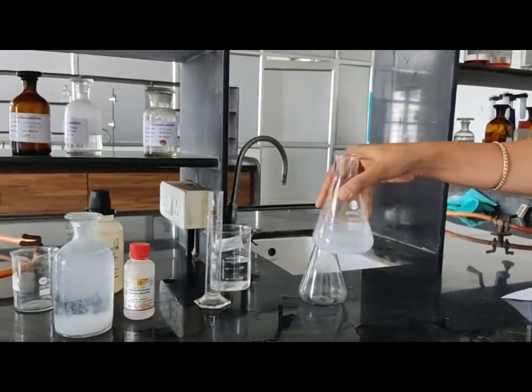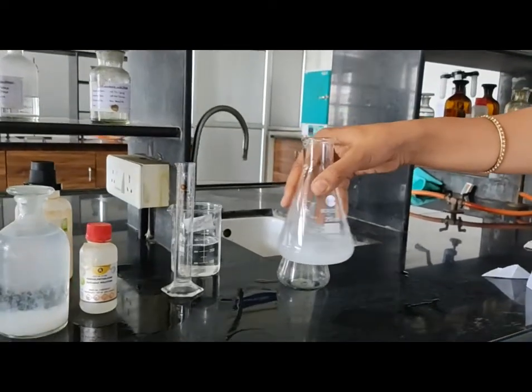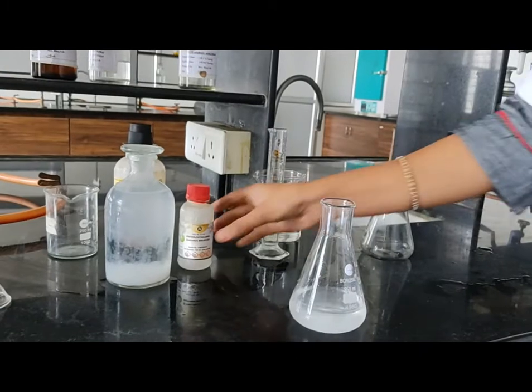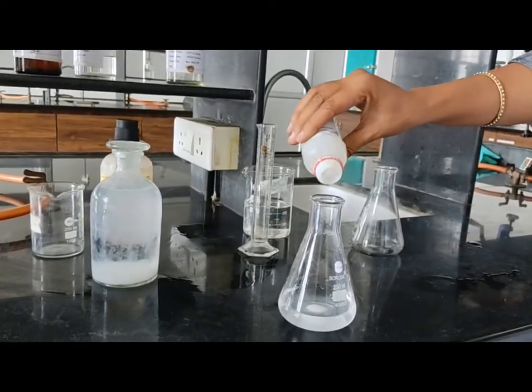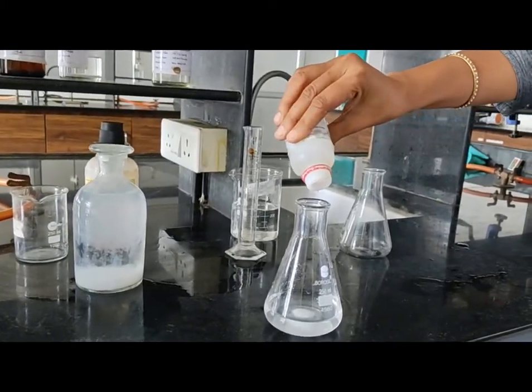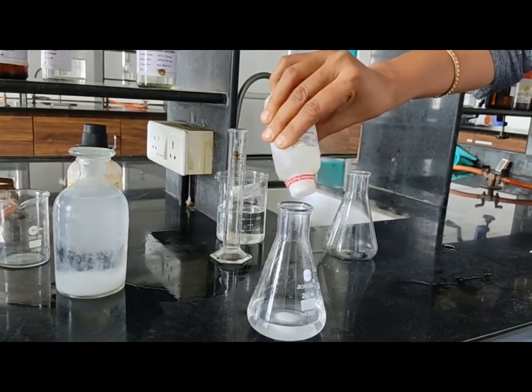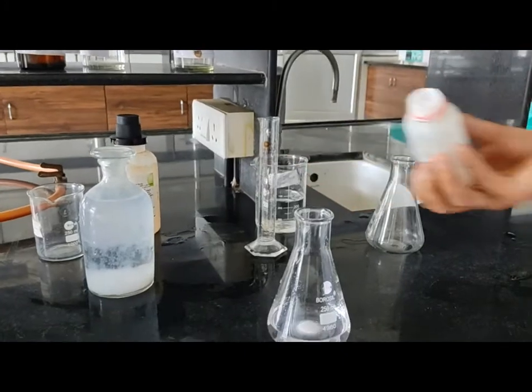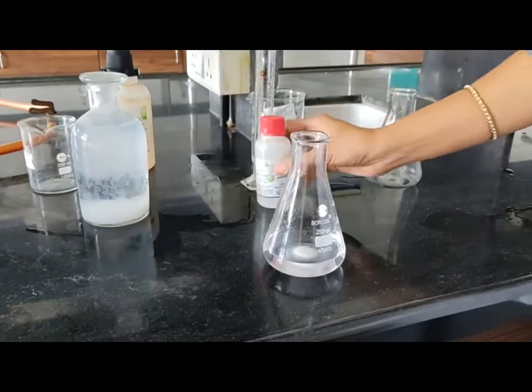Add water to dissolve the potassium hydrogen phthalate, then add 0.1 ml of phenolphthalein indicator. Shake it properly.